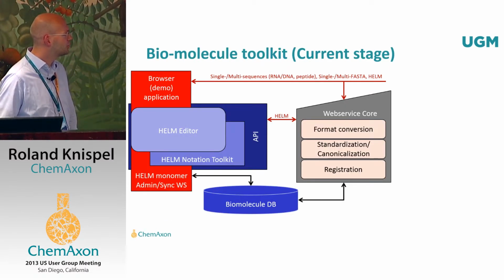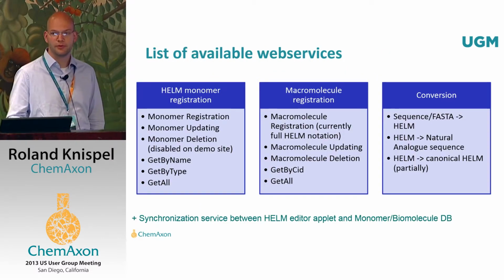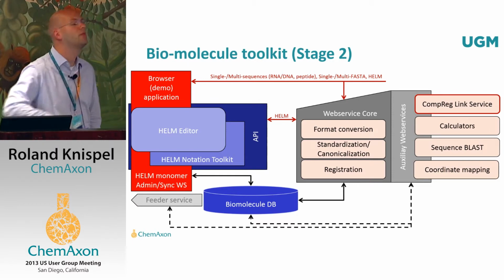So that's the current stage. And this is just a list of services which are available. You find this in the presentation, which is on your pen drive, so I don't want to go into details here for time reasons. Where do we go from there?